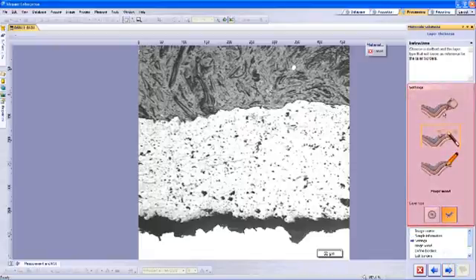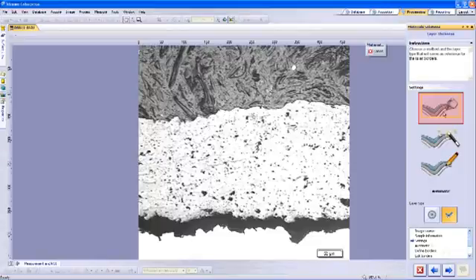Within Settings, we have the ability to choose how the contours are to be defined. The choices are Automatic Definition, Magic Wand Definition, or Manual Definition. Automatic Definition is set to define the contours based on a difference in threshold value between the background and layer. The software will automatically determine this difference.